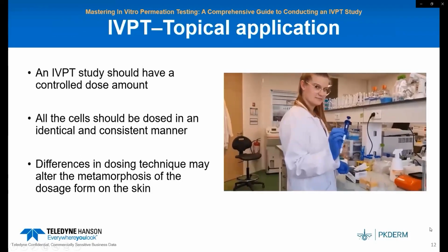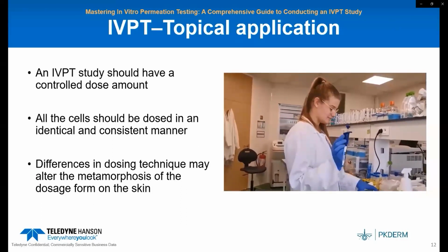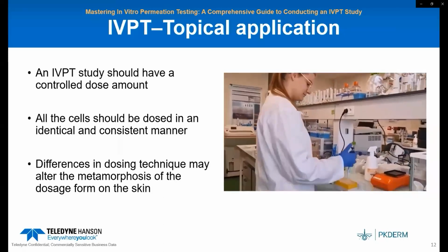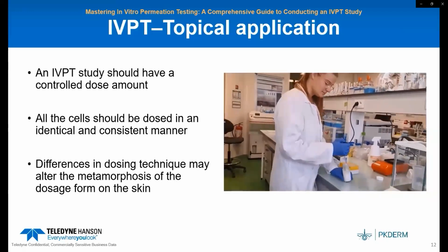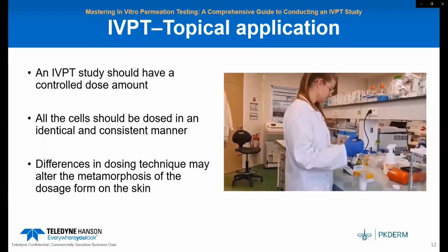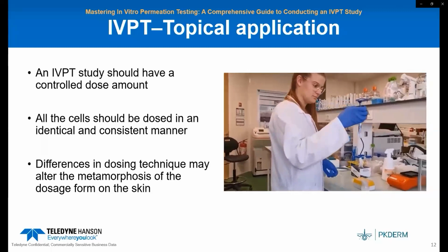For topical application, different forms of finished product can be used in IVPT. For example, we can use a solution, cream, ointment, or gel. For semi-solid formulation, we use a positive displacement pipette for topical application.